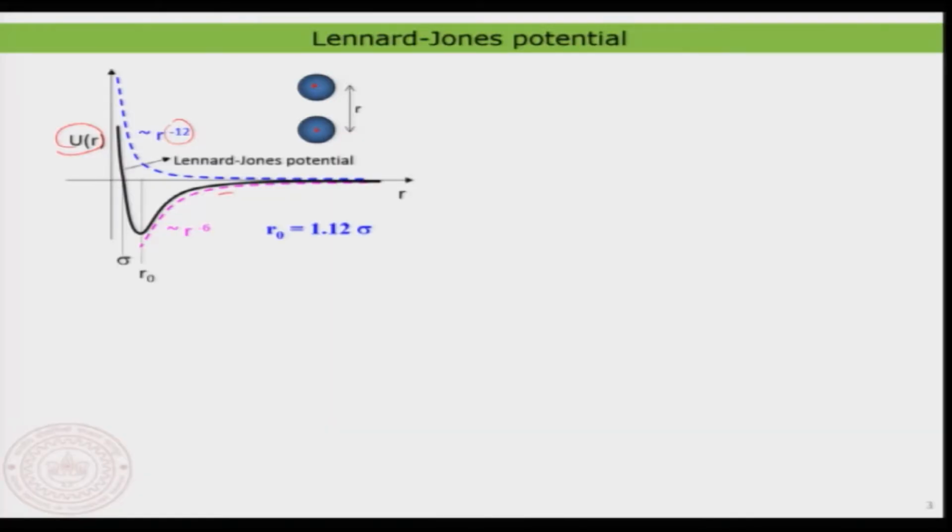So, altogether what you are going to feel is an effective potential of both these repulsive and attractive forces, and that is commonly known as a Lennard-Jones potential, which has a shape like this, the black curve. This is a typical curve that you would see when two objects are coming together. It indicates that they are attractive in the beginning, then everything is repulsive in nature.